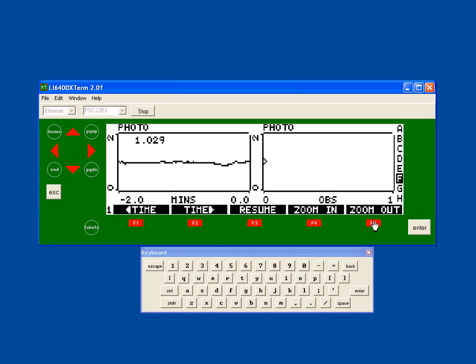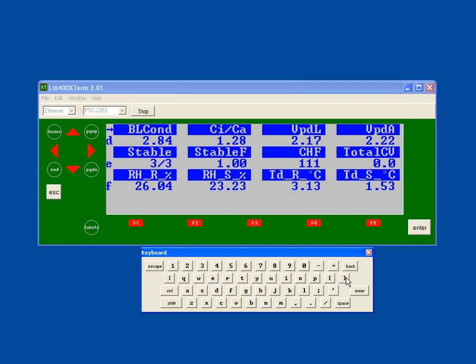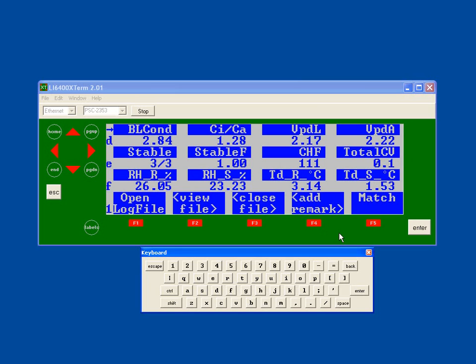The amount of data that's kept in the buffer is all defined in the graph setup screen where we were previously. The last item in the graph setup screen is a buffer. So if there's any particular graphics plane that you would like to have more data held in the buffer, say rather than the normal 10 minutes, perhaps you want an entire experiment length, which might be something like 30 or 40 minutes, you could change that buffer so that it reflected the length of your experiment. You can press your right bracket key and you'll be returned back to New Measurements display.